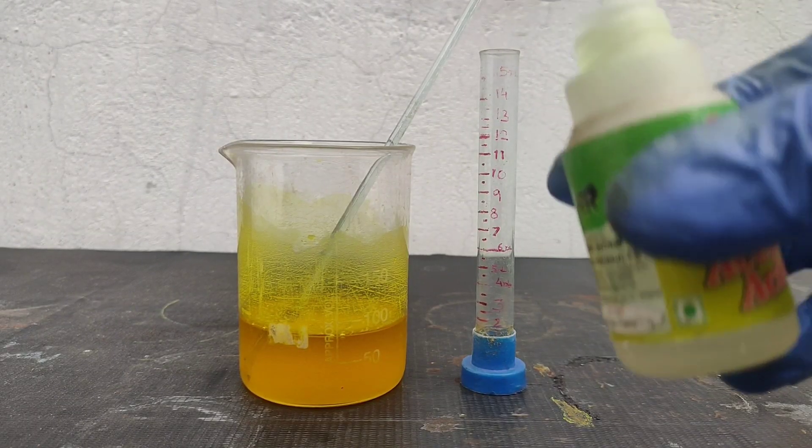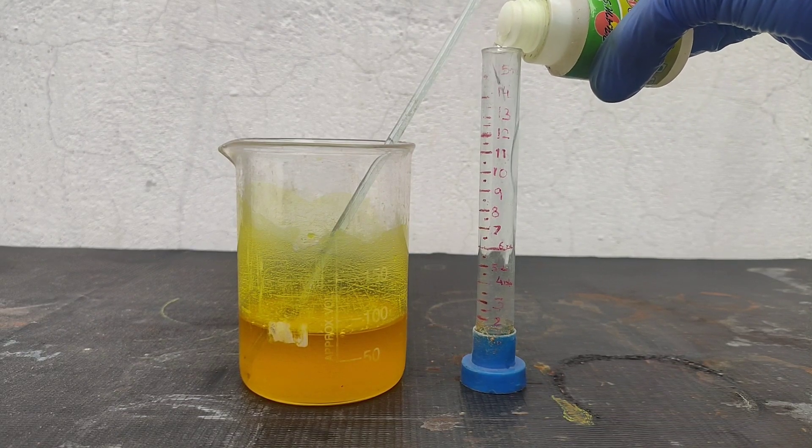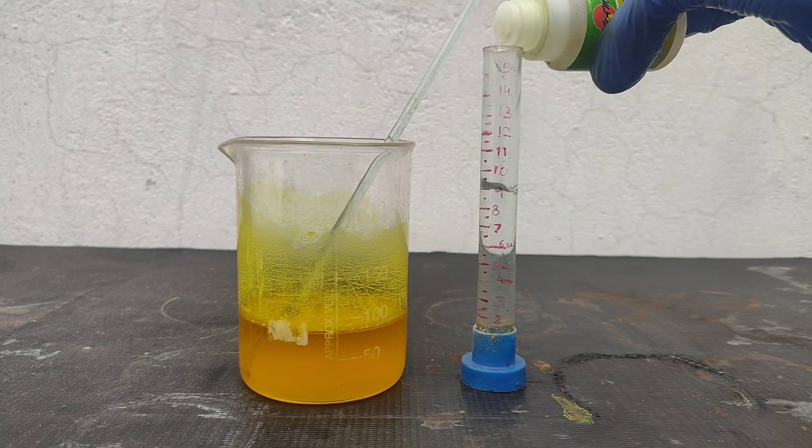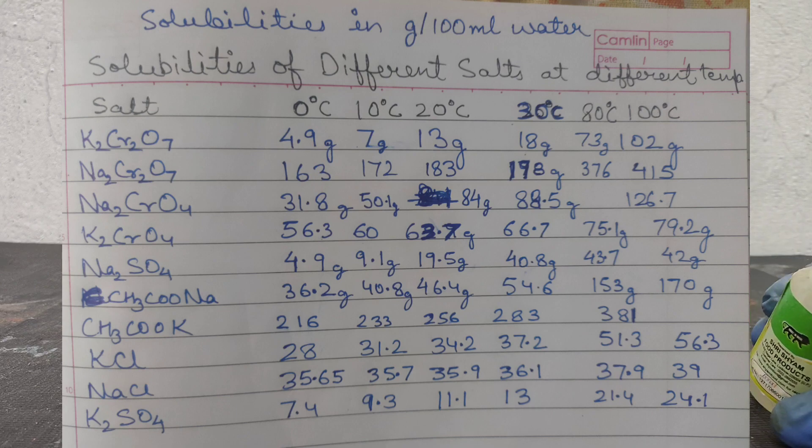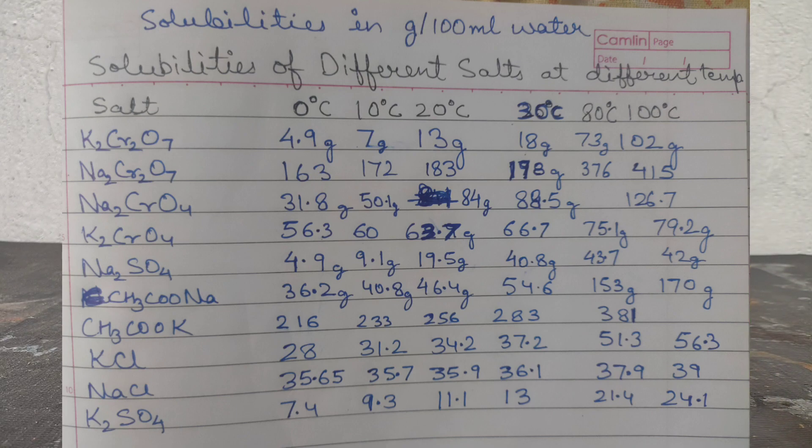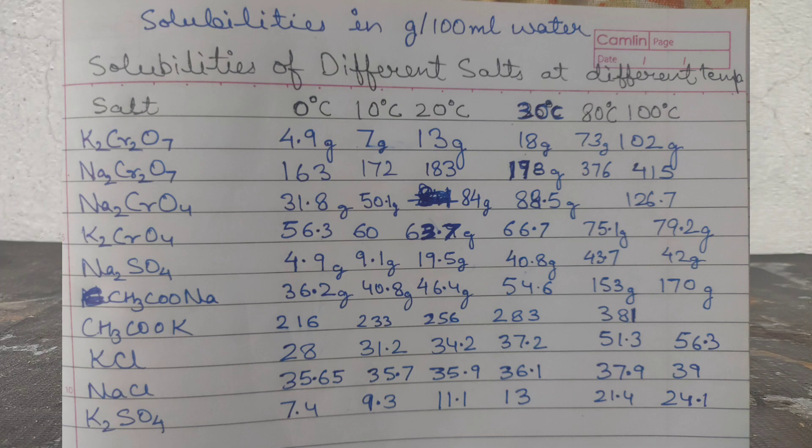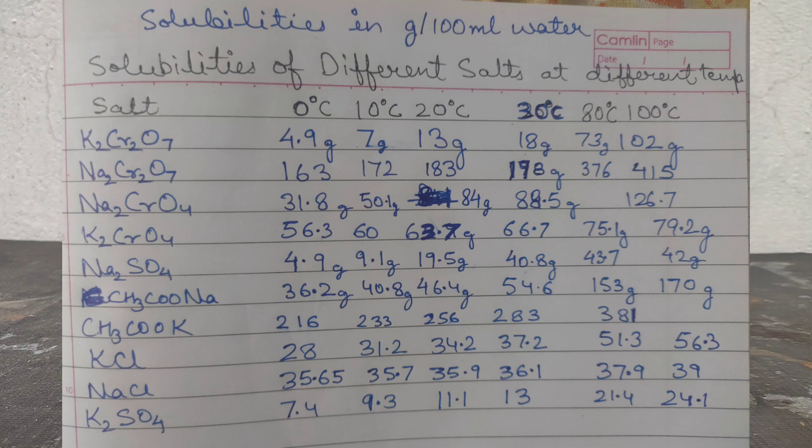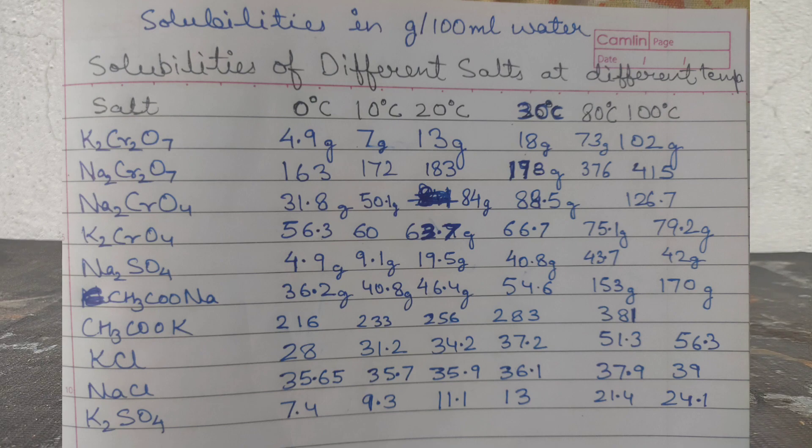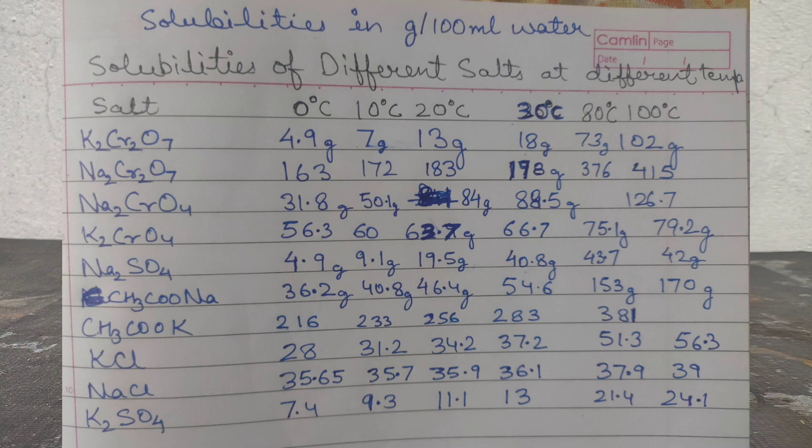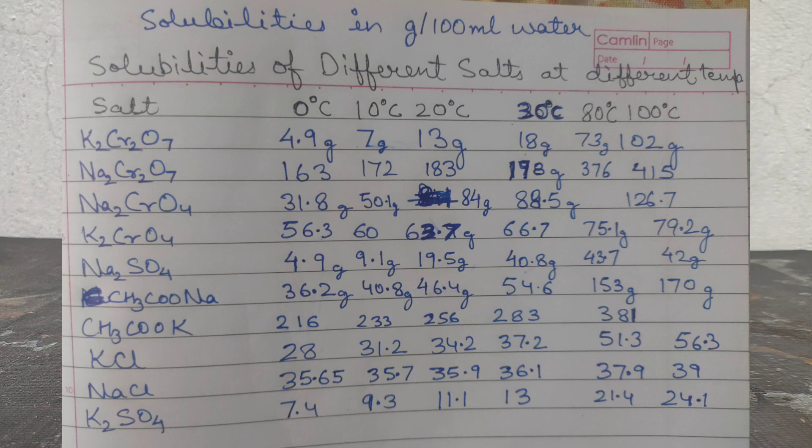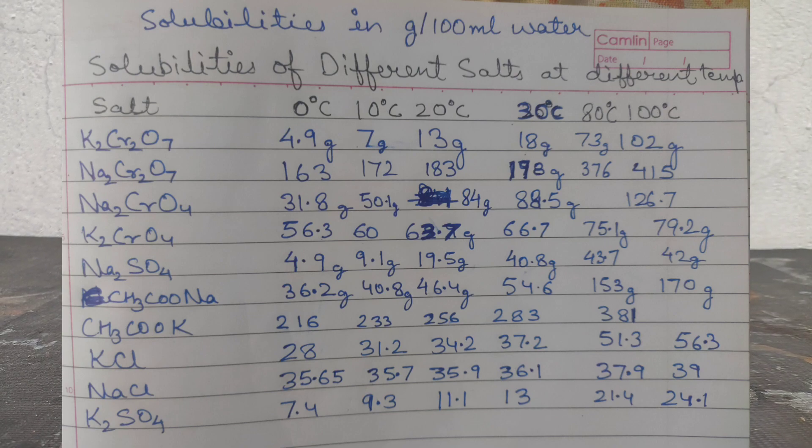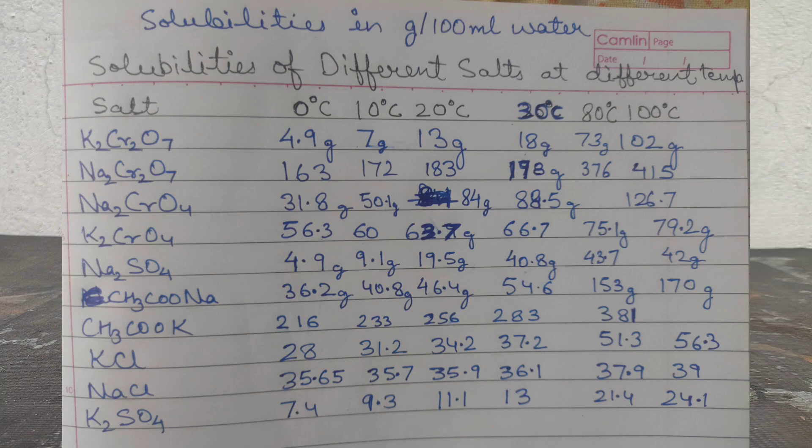Now to convert it into dichromate I am adding 14 ml of glacial acetic acid to it. The reason I chose acetic acid over sulfuric acid or hydrochloric acid is that sulfates of potassium and sodium are less soluble in cold water, so they may crystallize out on cooling. Hydrochloric acid if occurs to be in excess would react with dichromate to form chlorine and chromium chloride. And even if we add hydrochloric acid very accurately, the high concentration of chloride would crystallize potassium chloride or sodium chloride out of solution. Sodium and potassium acetates are highly soluble in water, so therefore I chose acetic acid for this purpose.